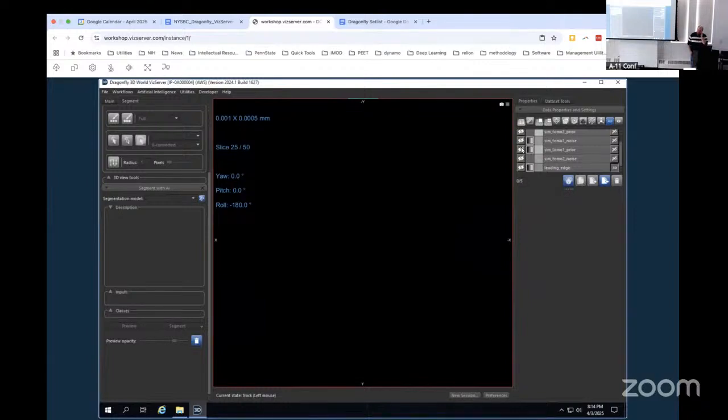Okay. Well, how did you do things to generate the denoise? That's the button. No, okay, it's not being covered here, but we can talk about it. Sure. So I'm happy to do it. I can show you exactly how to do it. This is all out of CTS. So we're in MATLAB. Yeah. We're running our program. Yeah.